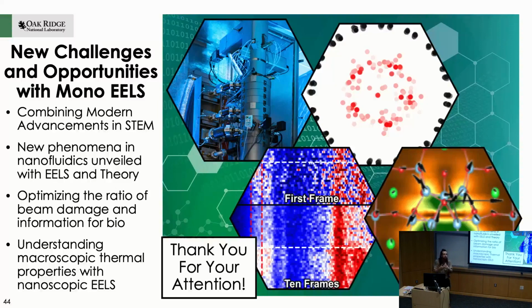The problem is that it's just so small, you can't apply a standard density measurement technique. You just don't have access with anything other than extremely high spatial resolution techniques to the individual tube. So I don't think there's any reason why you can't measure the density in the tube. I certainly believe it is physically possible to measure the density of the tubes. It's just that coming up with the experiment that would measure the density in the tubes is something I can't think of.